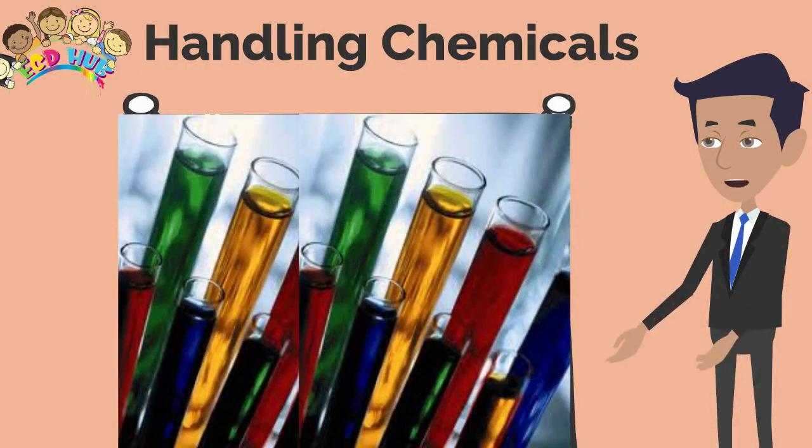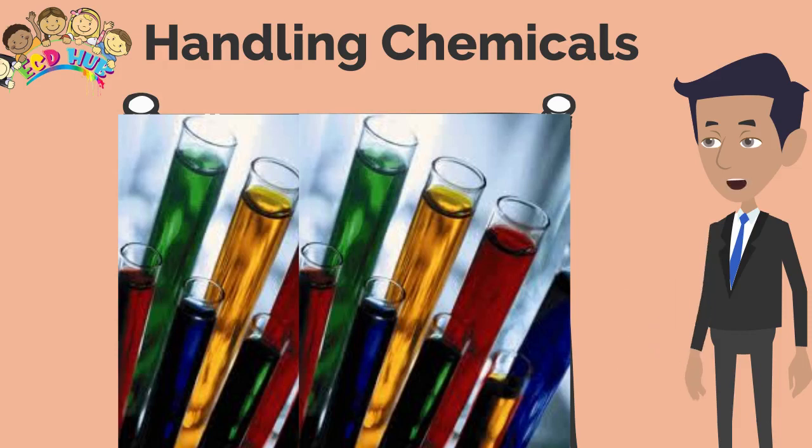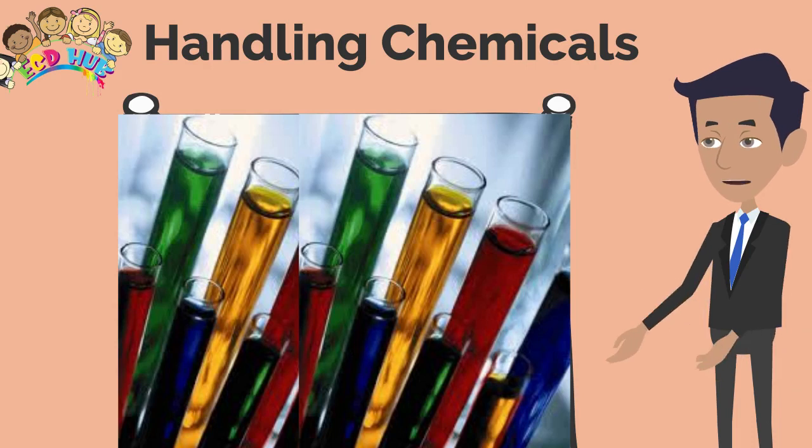When handling chemicals during lab, it is important to proceed with caution. Wear gloves whenever pouring chemicals or handling them. Never smell a chemical directly. You can waft or fan the fumes toward yourself.